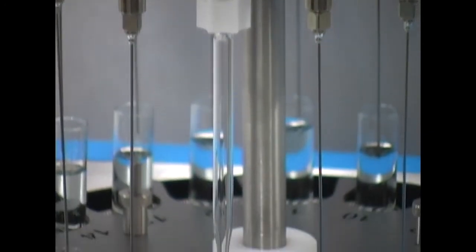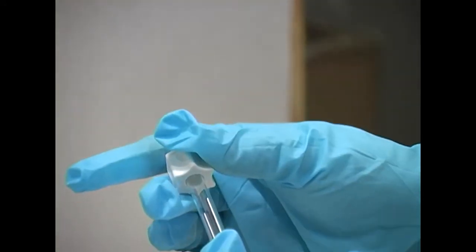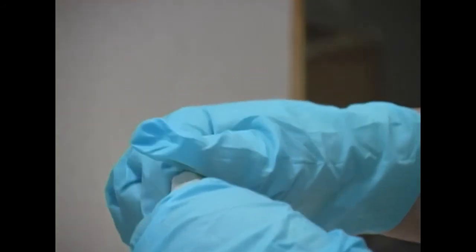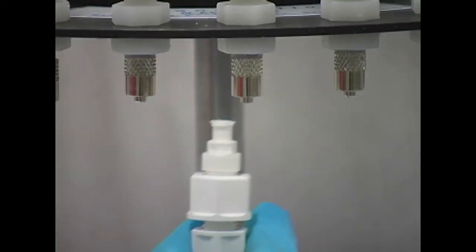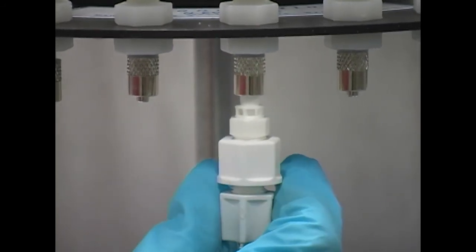Optional pasture pipette adapters can be ordered to allow the use of glass pipettes. To install the pipettes, push the pipette onto the end of the adapter — the tubing on the end of the adapter will make a gas seal. Once the pipette is on the adapter, screw the adapter into the lure fitting on the instrument just like a needle.